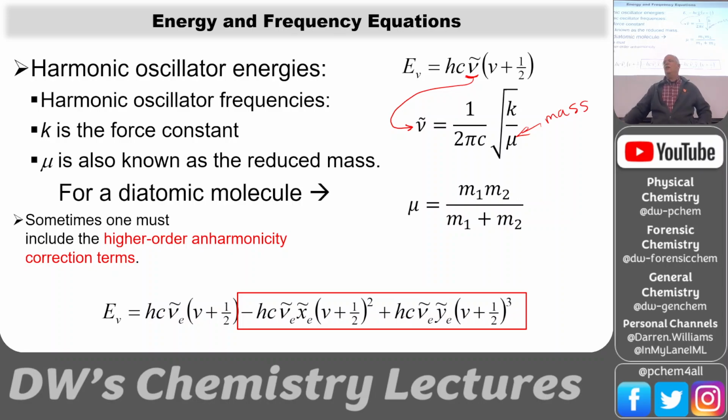You see this in your calibration curves, right? You want a nice linear calibration, but sometimes it starts to tail off. So you might add an x squared or concentration squared piece with a negative term so that you can model that little bit of curvature and maybe get a little bit more distance in your calibration curve.